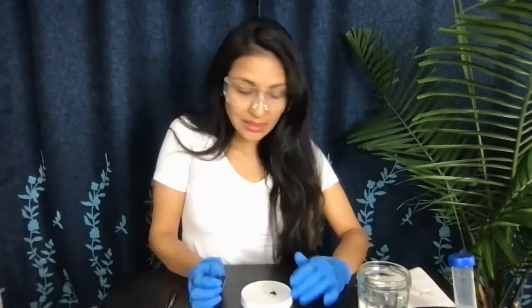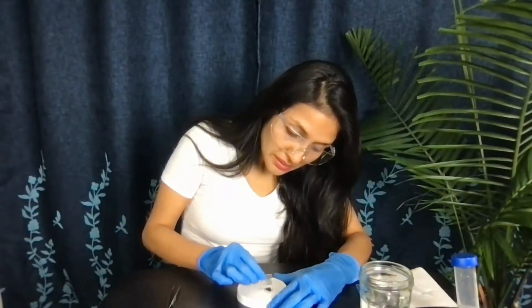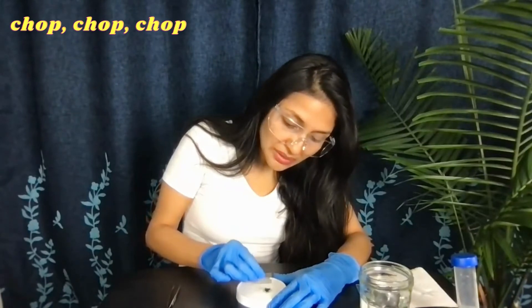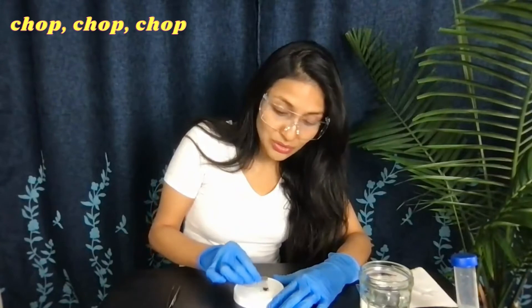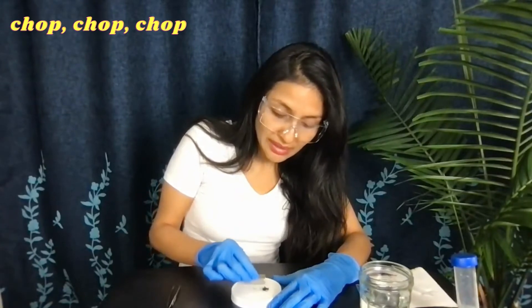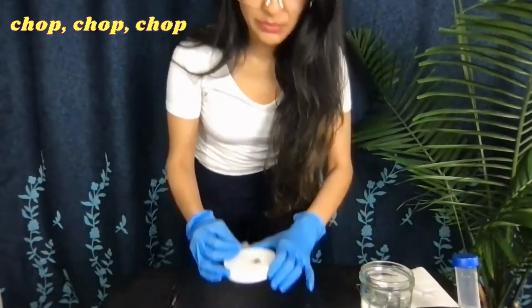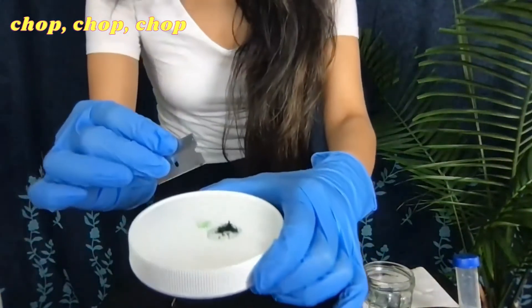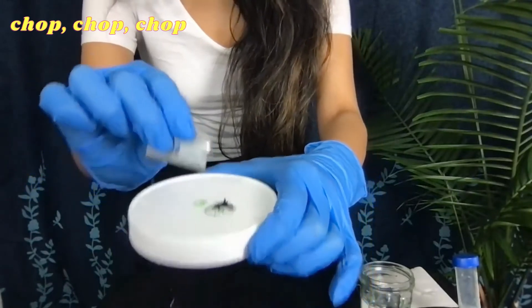Now I'm going to proceed with my razor blade. You can use a knife or even a spoon — anything that will allow you to literally chop it up softly. You will see how different little pieces start to go into the water. That's why the water is also useful: it gives them more freedom to move around and makes it easier to isolate them.